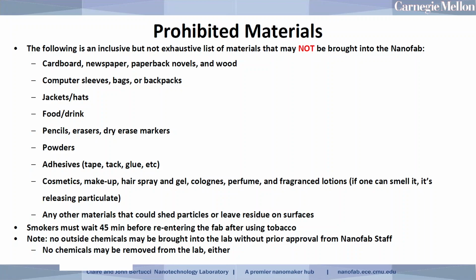So then also we ask that users go easy on any type of cosmetics, makeup, hairspray, gel, cologne, perfume, anything that has a fragrance to it is going to be releasing particulate. So avoid the use of those where you can, for sure, when you know you're coming into the lab. And then finally, any other material that would either shed particles or leave residue on surfaces. Those are the things that we're trying to avoid. And if you have a question about a new material or something that's not listed here, please reach out to the Nanofab staff, and we'll be happy to advise you.